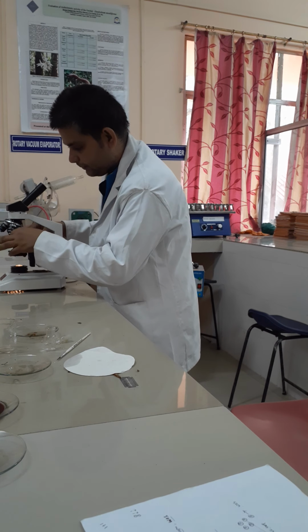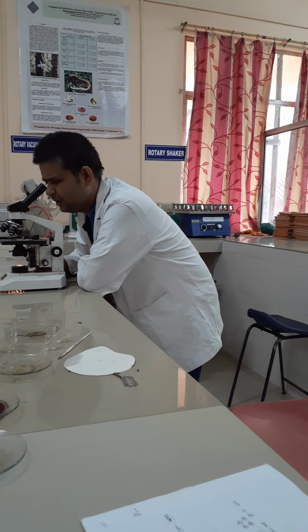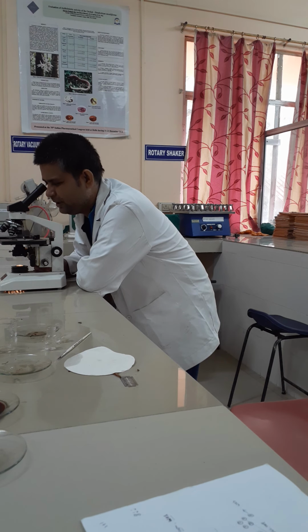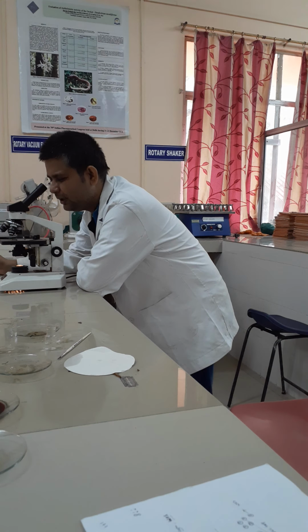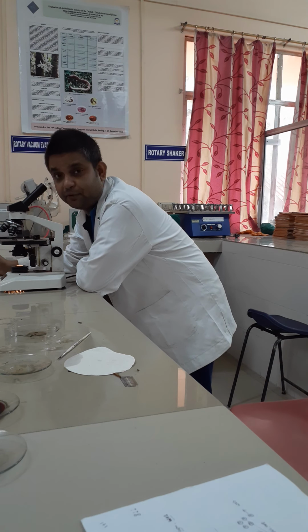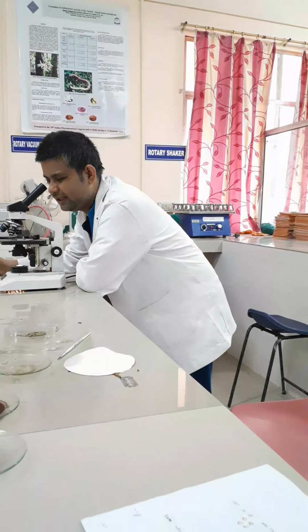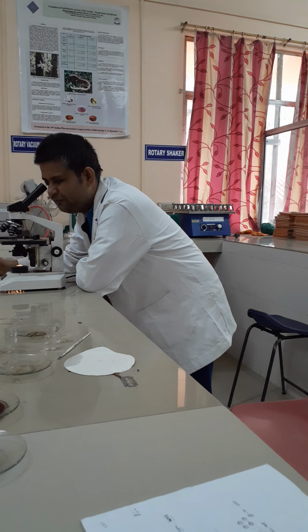As it is a bark, a few characteristic features of the bark will look similar. Here you can find at the topmost part the cork, followed by very small tiny pink-colored structures. These are the pericyclic fibers. Remember one thing, a very important feature: Cinchona contains the longest fiber. Cinchona contains the longest fiber. Here you can find very characteristic pink-colored dots as fibers.